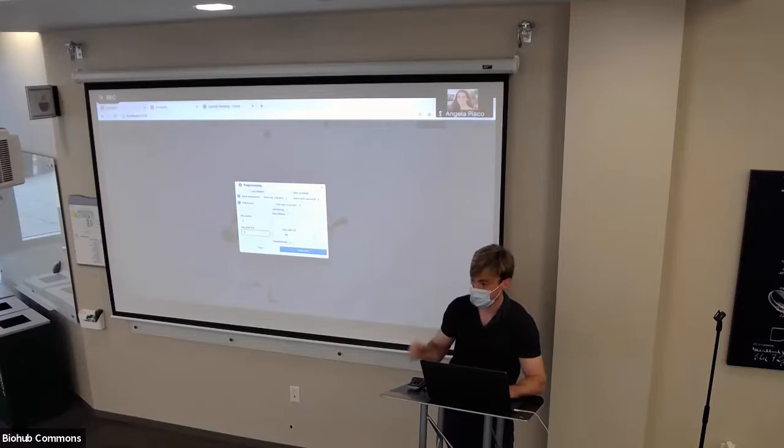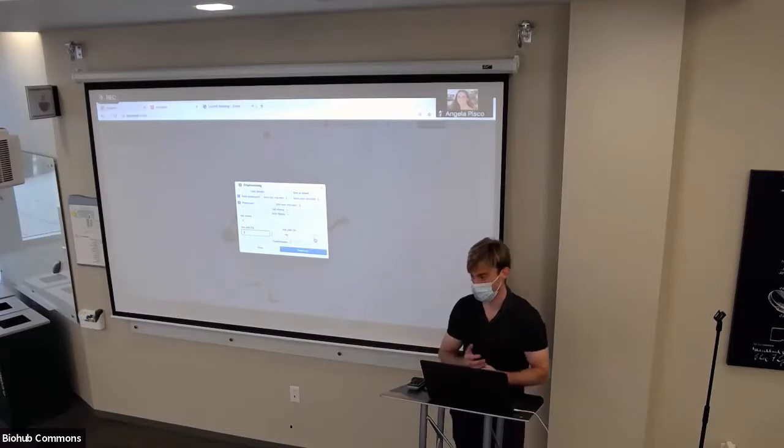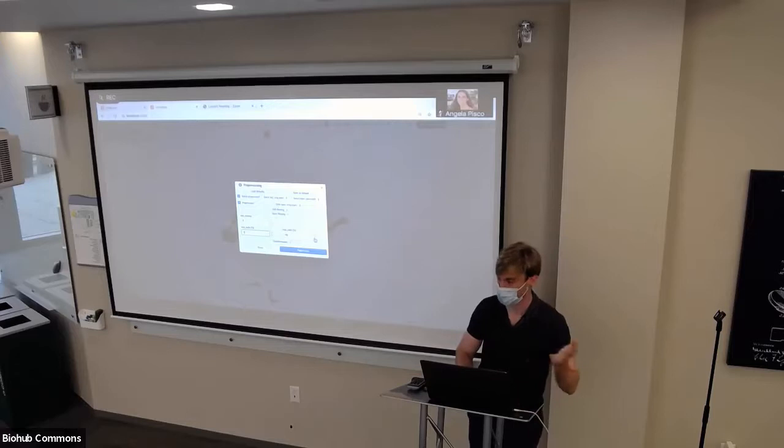If it's a huge cell atlas of 480,000 cells and you have a cell type of 20 cells, that's way less than 1%. So any marker genes expressed in that would actually get removed if you use 1 here. So you've got to be a little bit careful with how you choose the parameter. But 1 is actually the default in most pipelines. So that's kind of funny. It could be really destructive because you just remove all those marker genes.